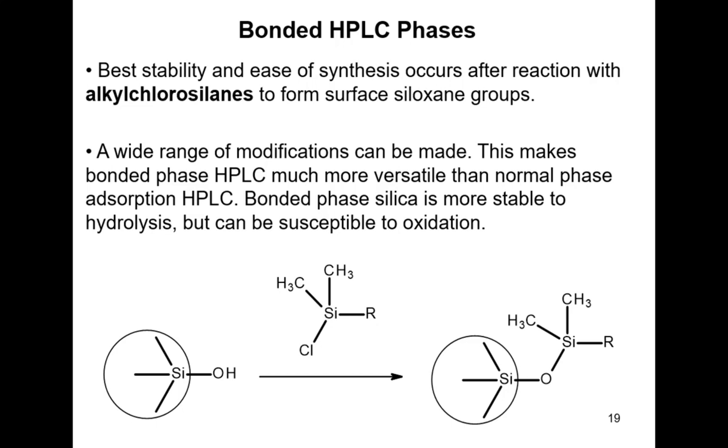So some of the advantages of doing this are we're increasing the range of different properties that the stationary phase can have, so that we can efficiently add lots of different alkyl groups at the R position, because it's relatively easy to synthesize the initial reagent with a range of different modifications here, but it's the same fundamental process involved in then adding that to the silica once you've synthesized the chlorosilane reagent.